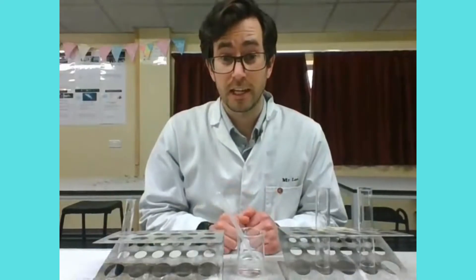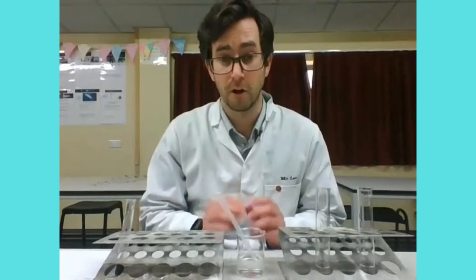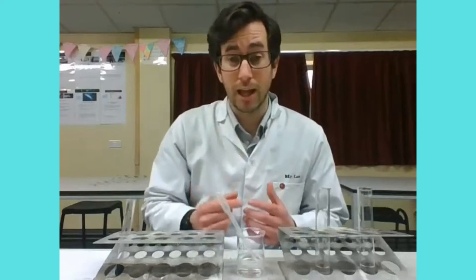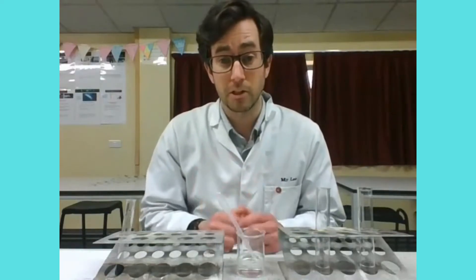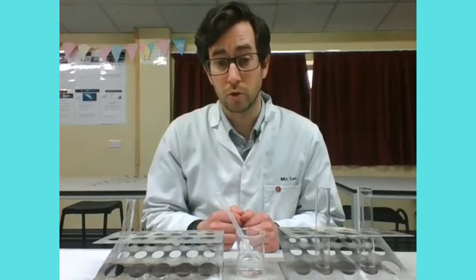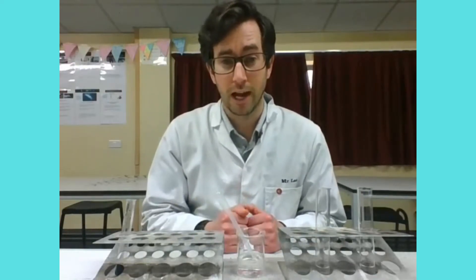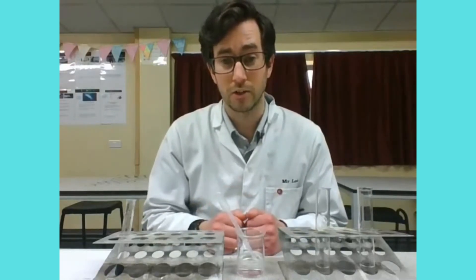I've now done the experiment twice so I can calculate a mean volume. Because I was counting drops, I've measured that one drop is approximately 0.05 cm³, so I can multiply the number of drops by 0.05 to get the volume. I'll do that now, calculate a mean, and then show how we can calculate the concentration of the alkalized solution.